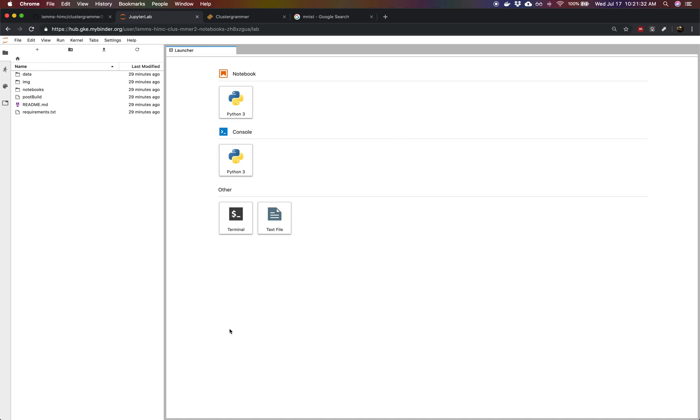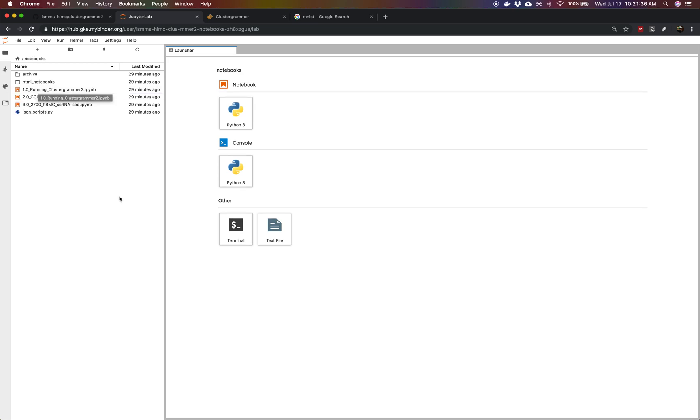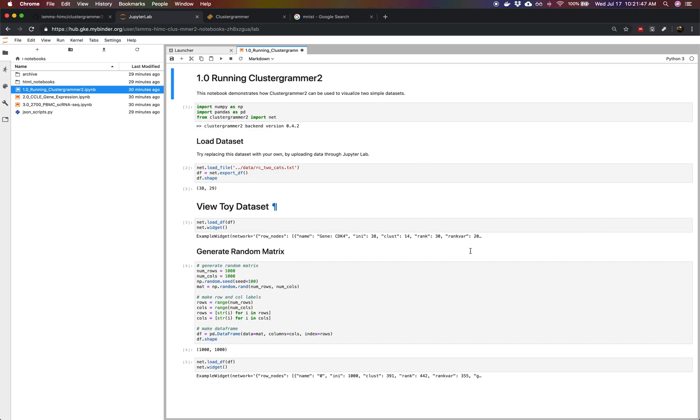From this, we can launch the notebooks that we have in our repository. If we double click the notebooks folder, we see three notebooks. We're going to start with the 1.0 running ClusterGrammar 2. If we double click that, it takes us to the notebook and starts up a Jupyter kernel and a Python kernel.